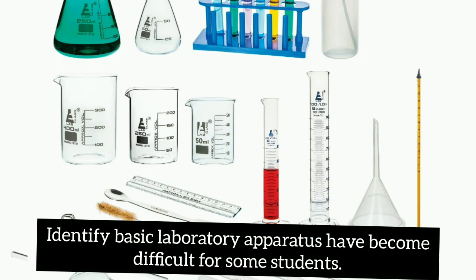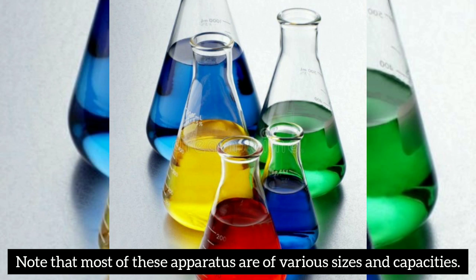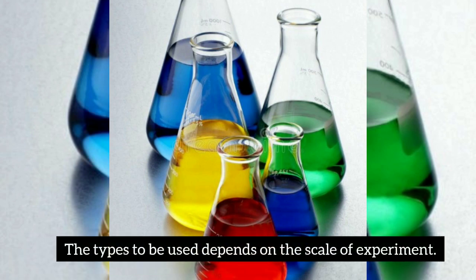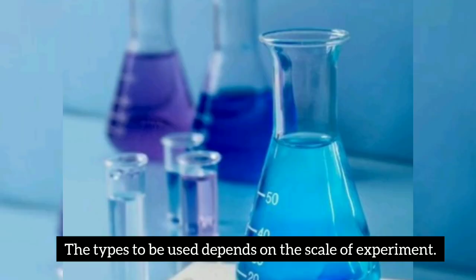Identifying basic laboratory apparatus has become difficult for some students. During the course of this teaching, I'll be showing you the most essential and frequently used apparatus and their uses. Note that most of these apparatus come in various sizes and capacities. The types to be used depend on the scale of experiments. So the kind of experiment you're carrying out will determine the type you use. That is, the scale of experiment determines the type to be used.